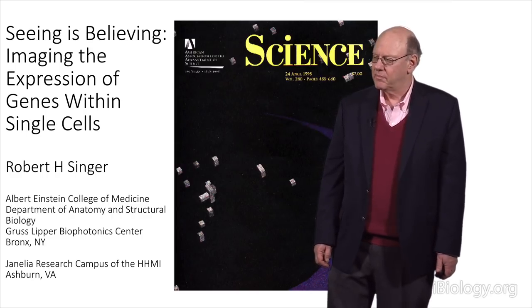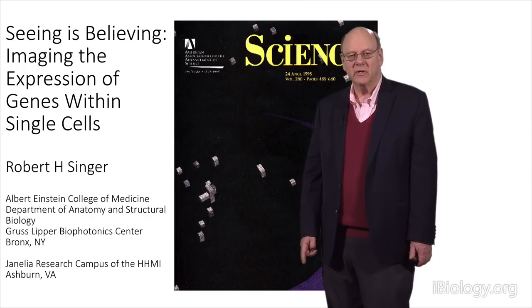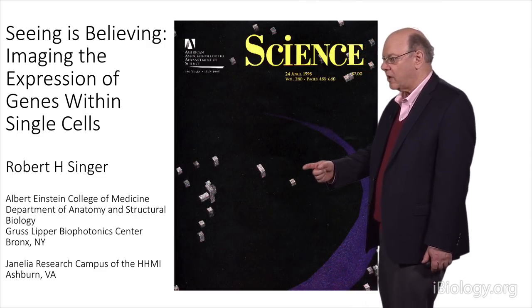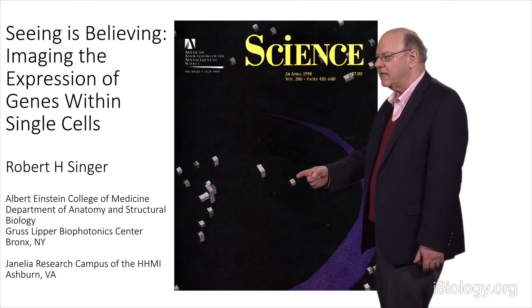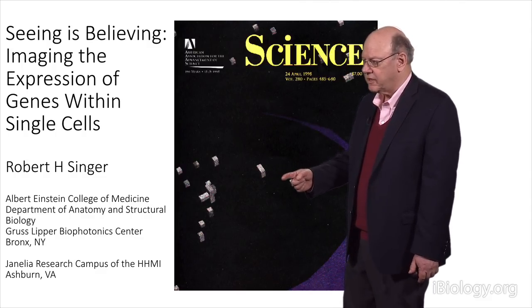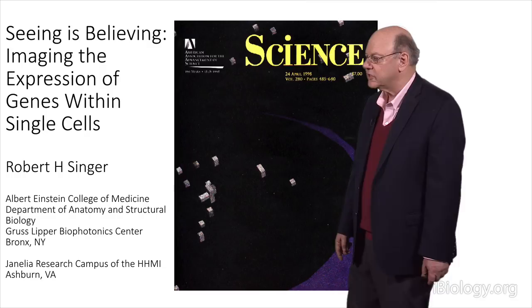What I want to talk to you about is the developments that led up to our ability to actually image gene expression within single cells. And that's illustrated here in this cover slide where individual RNAs can be seen in the nucleus of cells and in the cytoplasm. And this technology has taken a long time to develop, so I want to talk a little bit about the history of this technology.